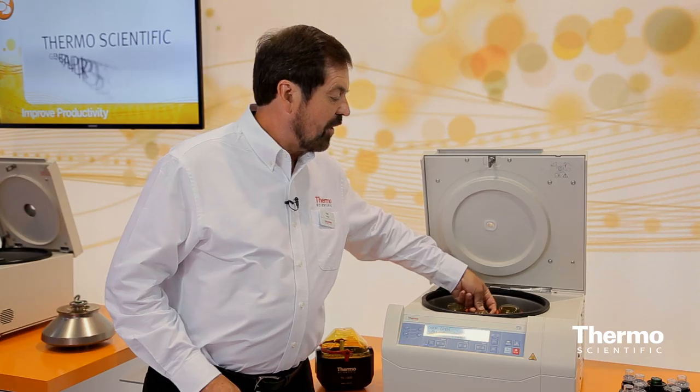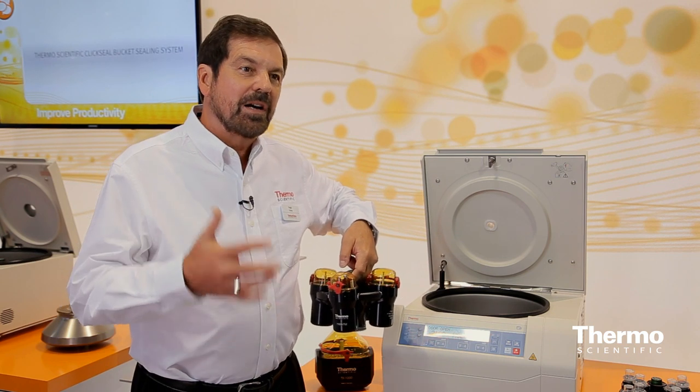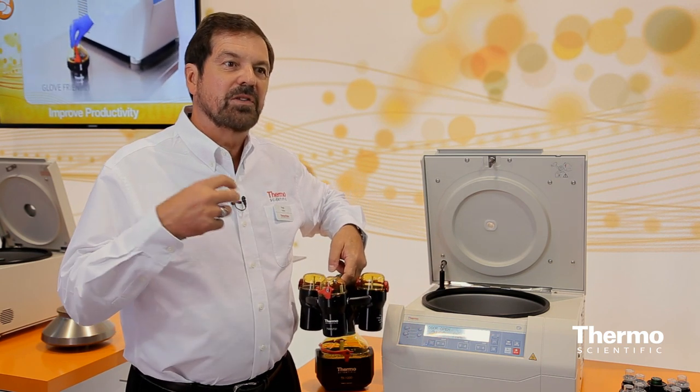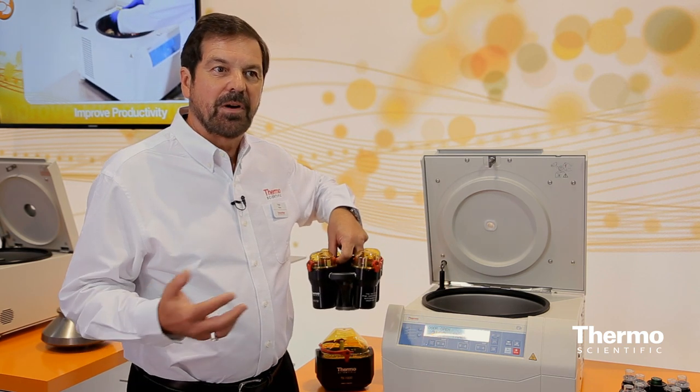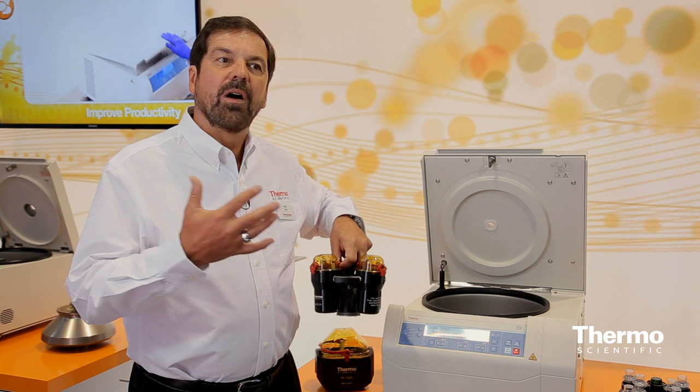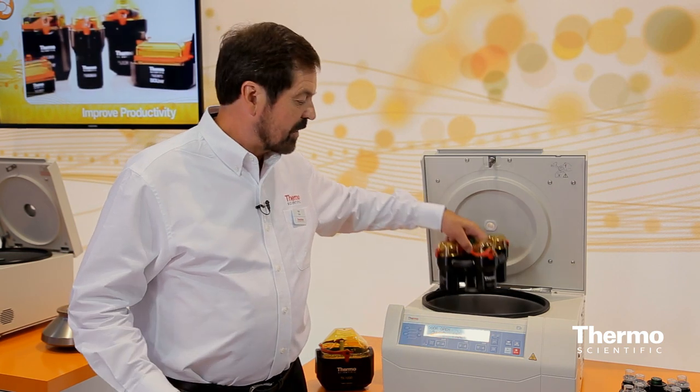Another standout performance feature is the auto lock system. Normally customers have to deal with complicated attachments, tools, and things like that for a centrifuge. But for a clinical customer, whether they're changing the rotors or cleaning the system, it's basically a three-second rotor exchange.